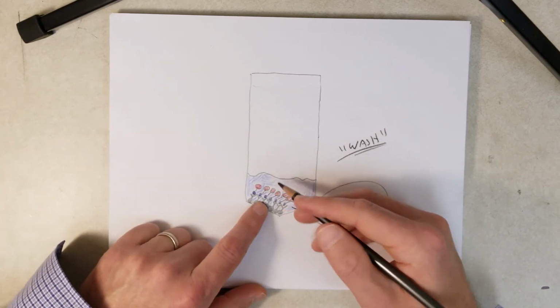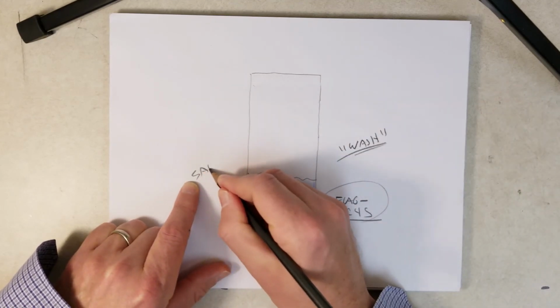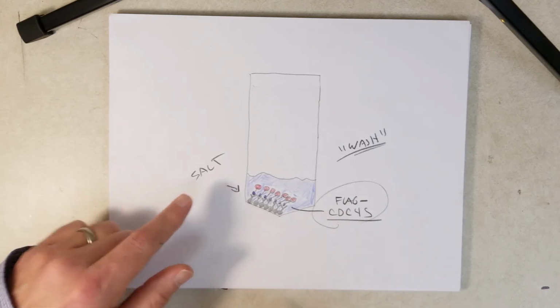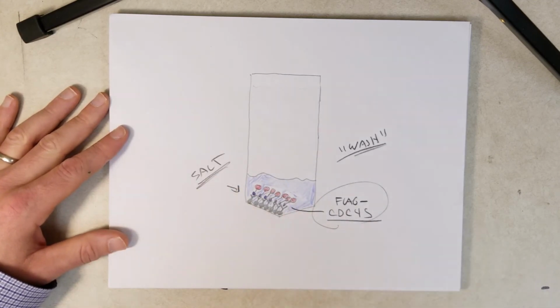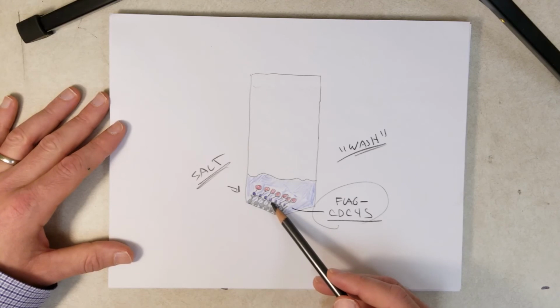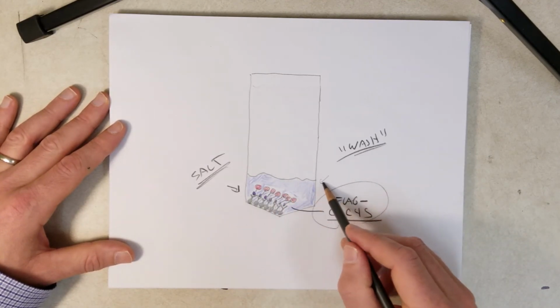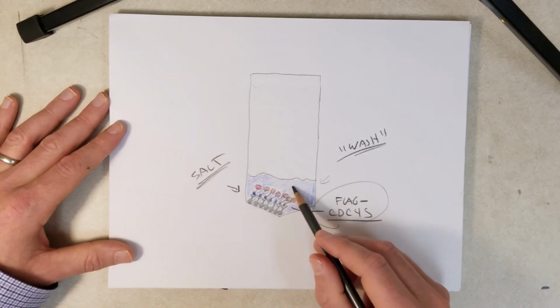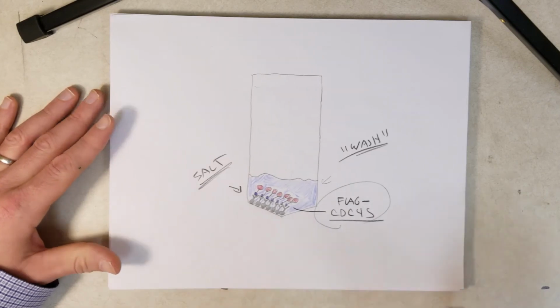Now, how are we going to separate this? Well, there are different ways to do that, by changing the salt concentration. I think that will break the interaction between the antibody and the fusion protein. Also, I think pH might have a role. So just by changing the buffer, you can break this interaction, and then you can just remove the supernatant here, and then your purified protein will come with the supernatant, and the magnetic beads will stay at the bottom. Okay, so that's essentially it.